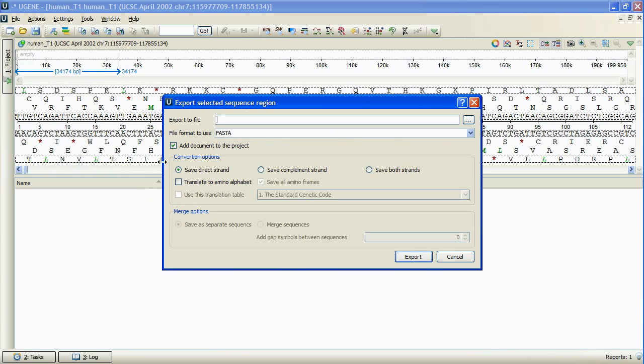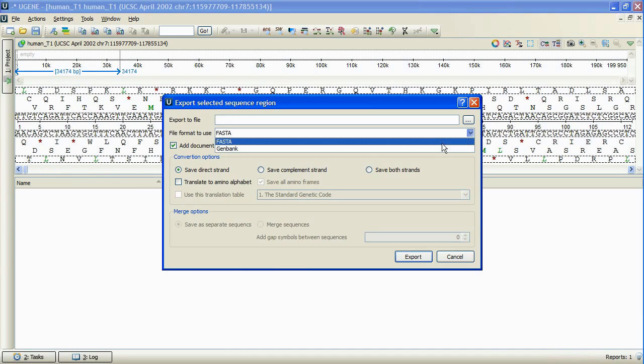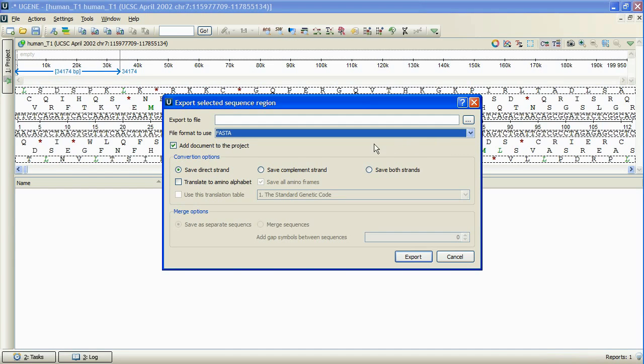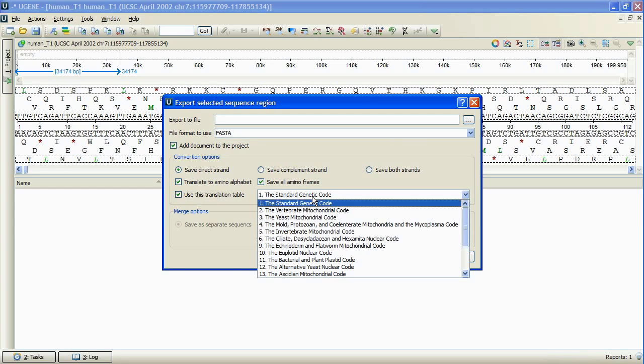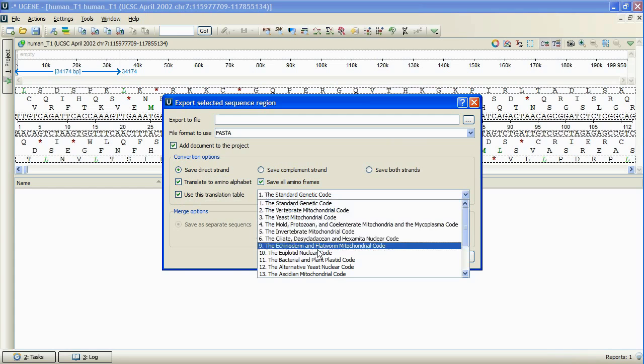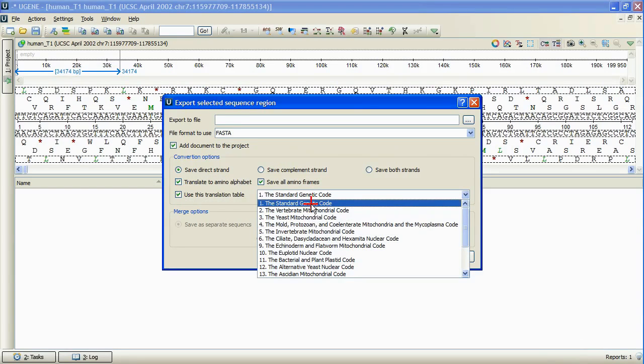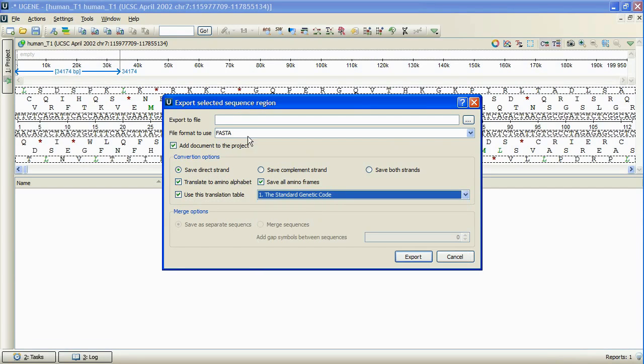As we see, the file format is now specified directly from the dialog. Also, if we choose translate to amino alphabet option, we can specify a genetic code to translate the sequence with. We finally enter the new file name and press export.